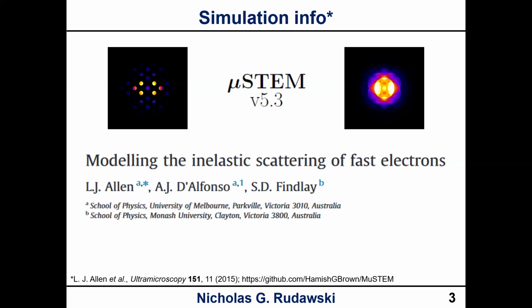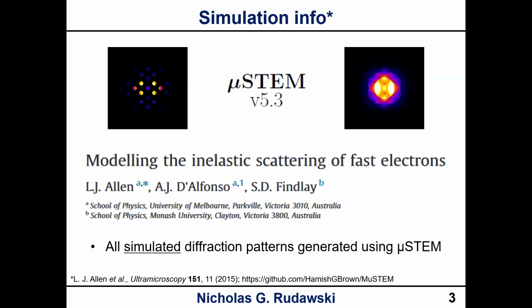It is fairly easy to use and you can use it to simulate lots of different STEM data. I used it specifically here to simulate what are called position averaged CBED patterns, which we're going to see a lot of today. These were all done using this MuSTEM package.